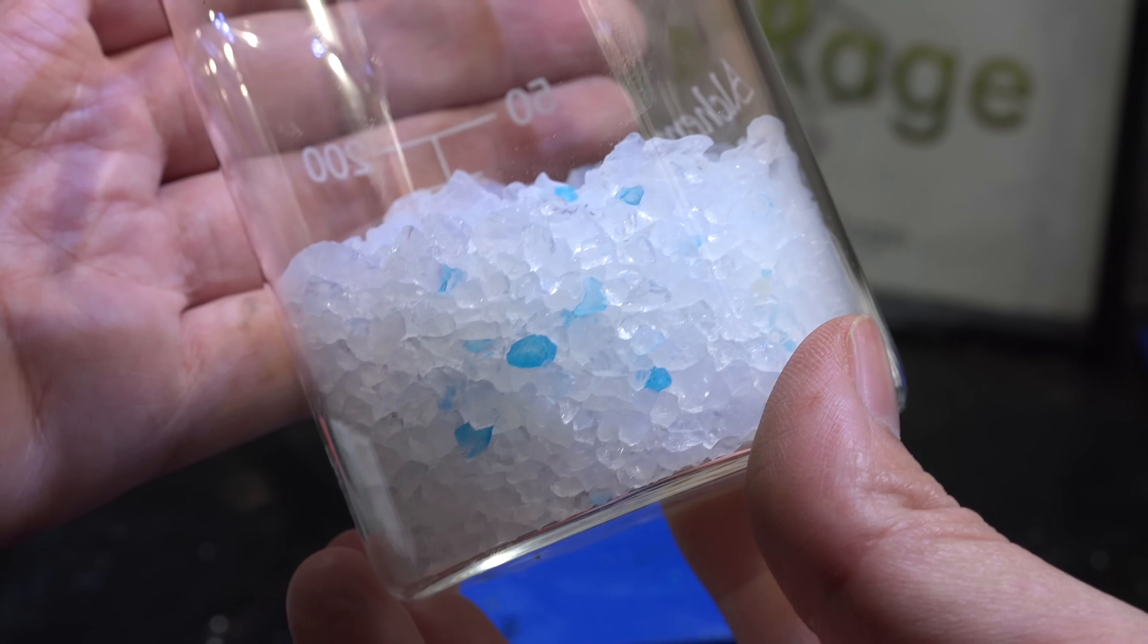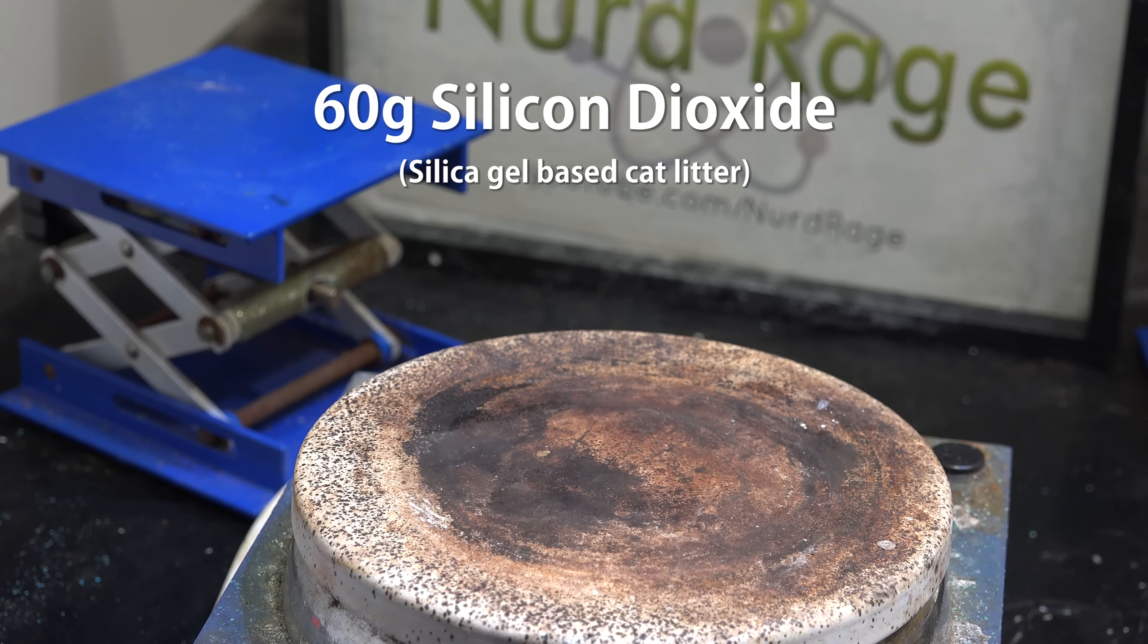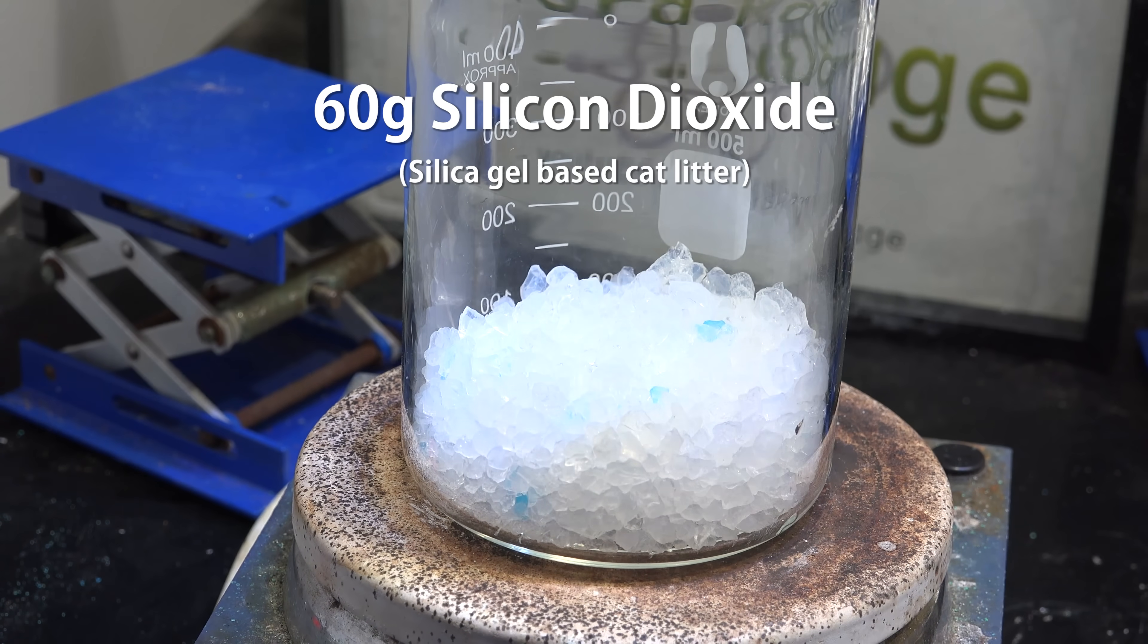For most of my work none of this will be an issue, but if you're doing sensitive chemistry you might want to pick out the blue particles and just retain the white ones. Now to make sodium silicate we start with about 60 grams of silica gel based cat litter.